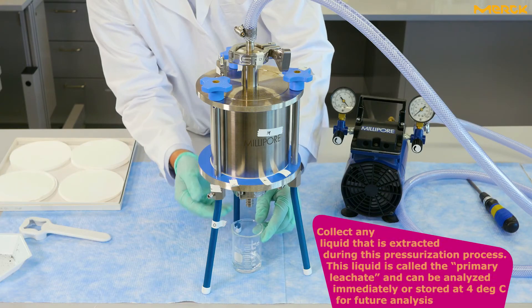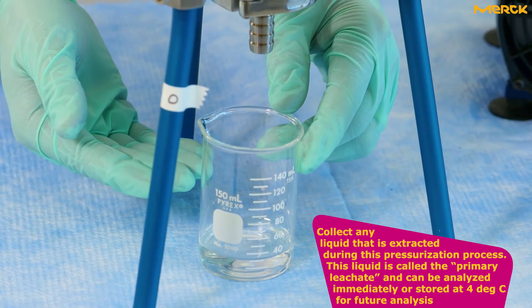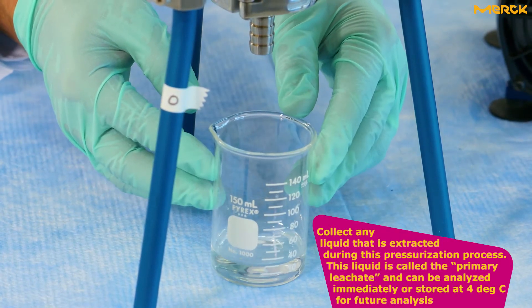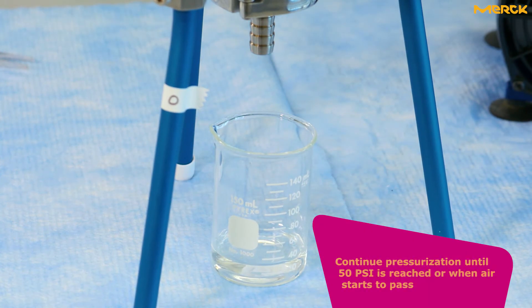Collect any liquid that is extracted during this pressurization process. This liquid is called the primary leachate and can be analyzed immediately or stored at 4 degrees Celsius for future analysis. Continue pressurization until 50 psi is reached or when air starts to pass.